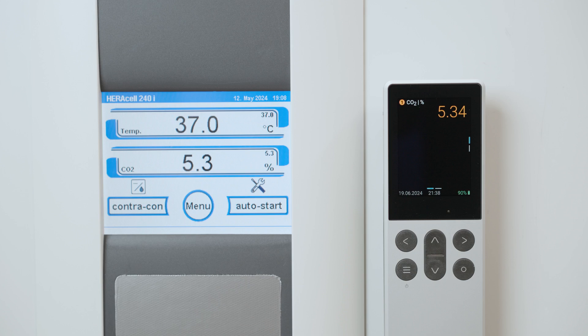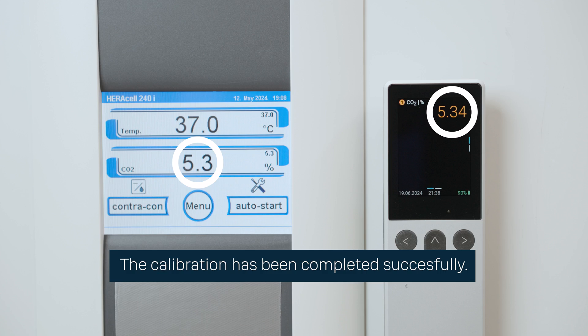After this, let's compare the readings of the freshly calibrated probe and the incubator CO2 reading. The CO2 value of the incubator should be adjusted accordingly to the handheld reference instrument through the incubator user interface. Now the calibration is completed successfully.